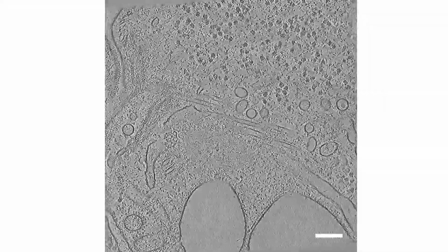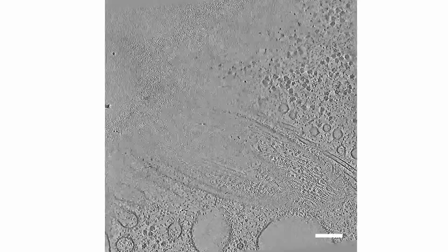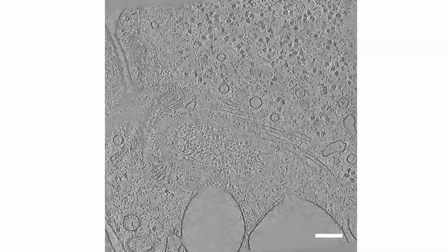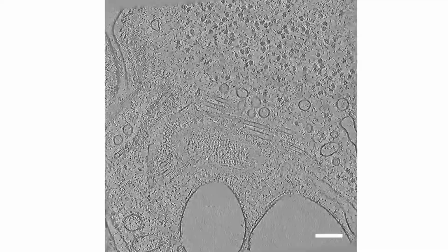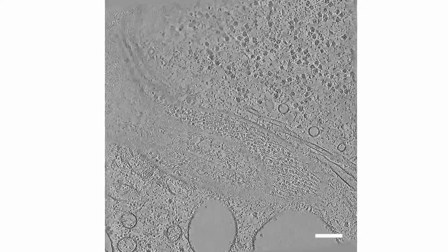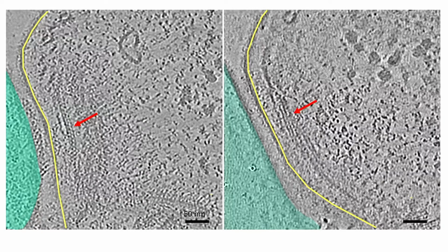This is very interesting because I never saw these in T. cruzi with plastic embedded samples. So maybe they are being lost and we didn't catch it, but it may also be new proteins or new constructs in this parasite. Okay, I'm finishing, Marcia.